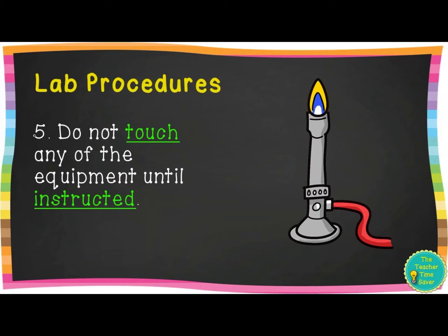Number five: do not touch any of the equipment until instructed. I know a lot of kids are going to be excited to play with the stuff to make the crystals, but that's not allowed. You have to wait until we're actually doing the experiment, because you could be spilling things. In some labs there's a Bunsen burner — a device used to heat up chemicals — but that's too dangerous for middle school right now, and in any case, don't touch any equipment until it's time.